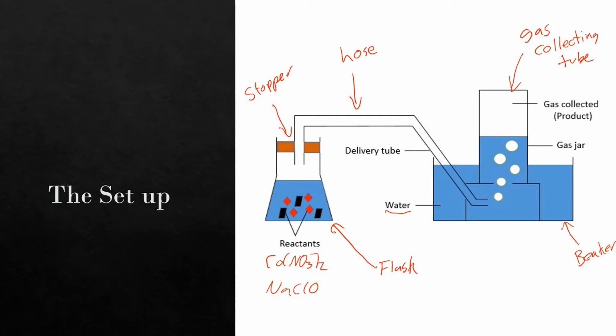Those are going to go through a reaction, and one of the things that it's going to be producing is oxygen gas. The oxygen gas is going to be building up in here. Since it has nowhere to go, it is going to go through the tube and into this gas collection tube. This gas collection tube is going to have markings on the outside, in kind of an opposite order. At the very top, it's going to say 0, then 1 mL, 2 mL, 3 mL, 4 mL, and maybe 5 mL or whatever. As it gets more and more gas in there, the level goes further and further down, and we can see how much gas we've produced.